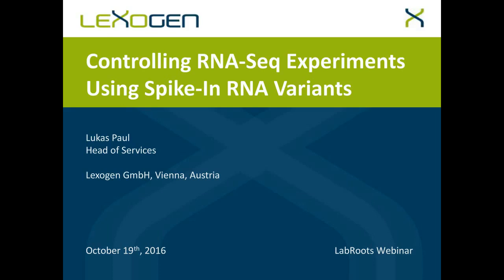So, thanks a lot, Christina, for this kind introduction, and welcome to you all. This webinar today will be about the use of spike-in RNA variants to control RNA-seq experiments.